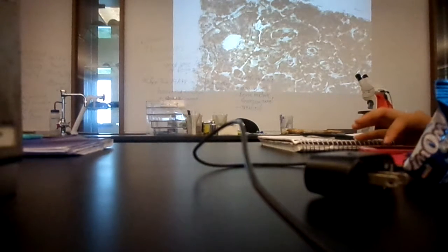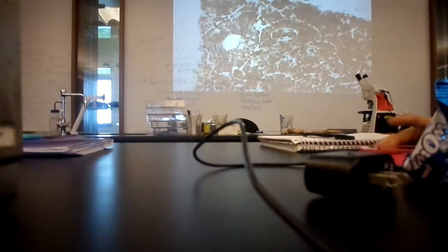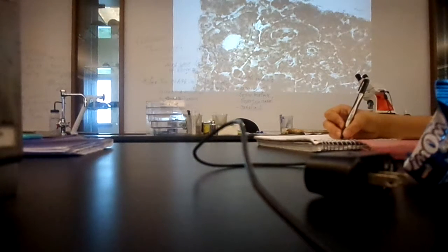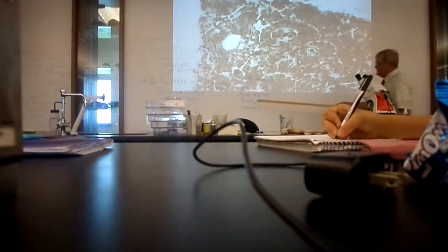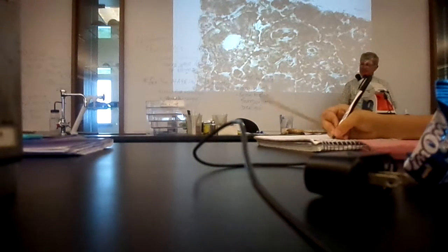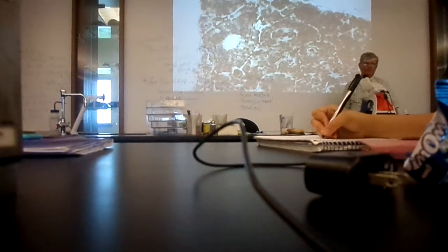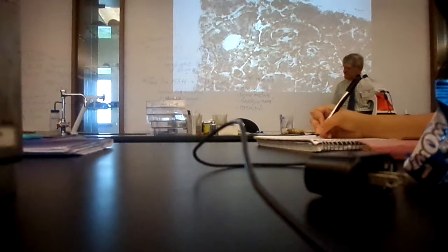But if we look at it microscopically, we see that there's a bunch of holes in it and little channels. Okay, are we okay on bone matrix? On this chart, here's the Haversian system. Everything that's yellow is bone matrix. Okay, about Tuesday now, make a notation because you have to have these dissecting instruments, and if you don't want to touch it with your bare fingers, have your gloves.